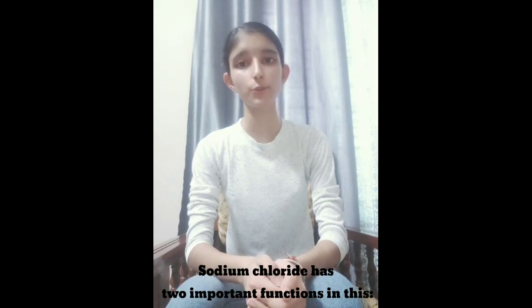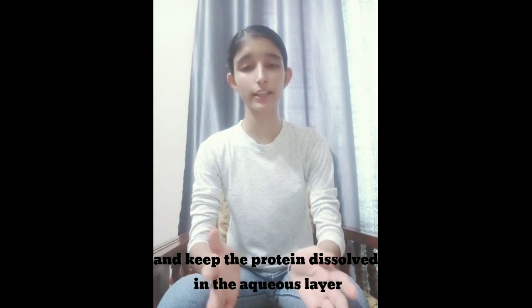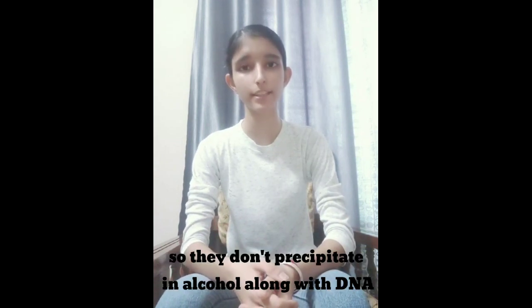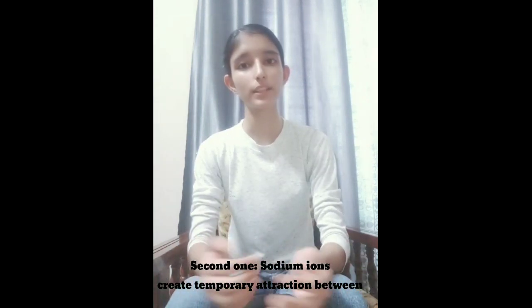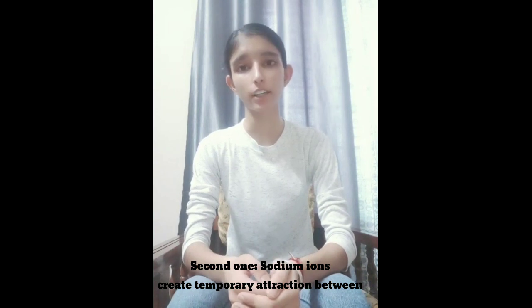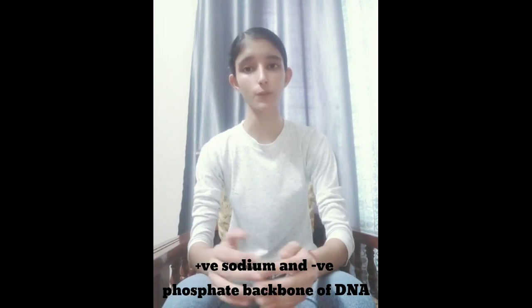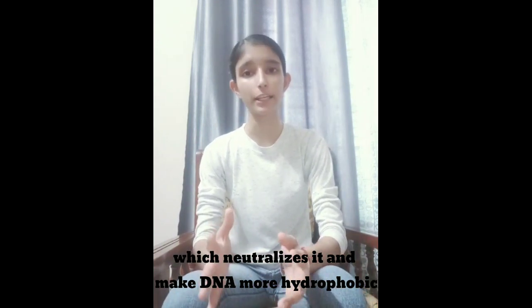Sodium chloride has two important functions in this. Number one is it removes protein from the cell and DNA, and keeps this protein dissolved in the aqueous layer so they don't precipitate in alcohol along with DNA. Number two is sodium ions create a temporary attraction between positive sodium and the negative phosphate backbone of DNA, which neutralizes it and makes DNA more hydrophobic. The salt is now completely dissolved in the water.